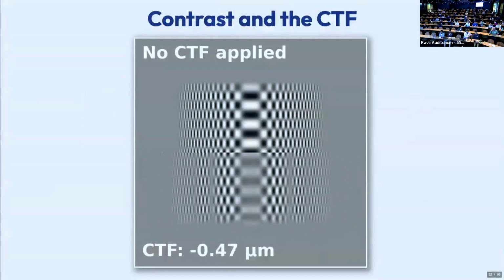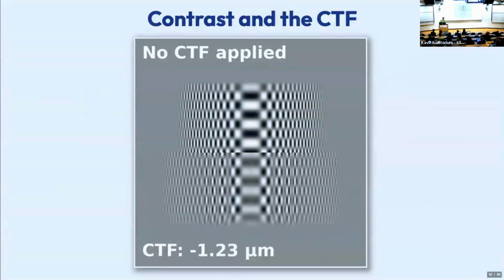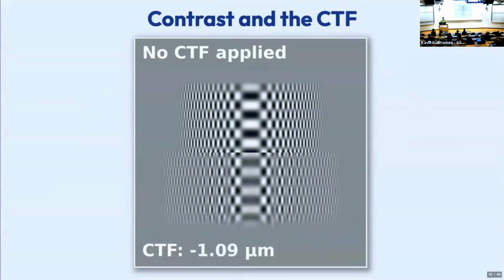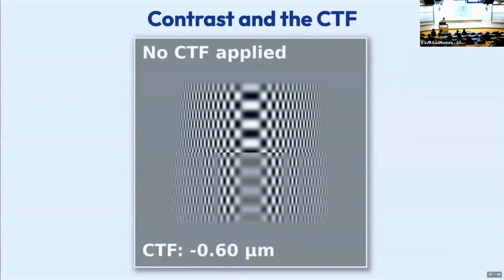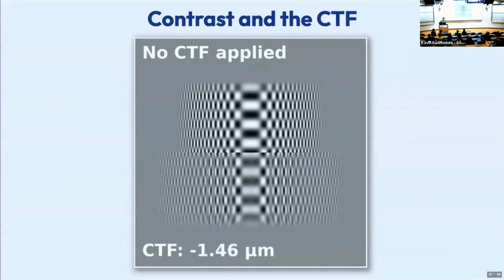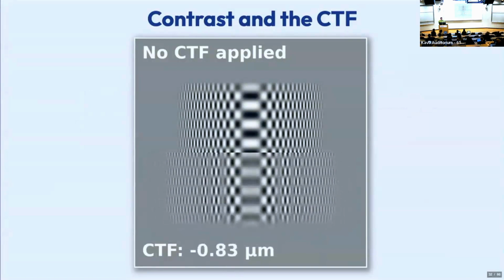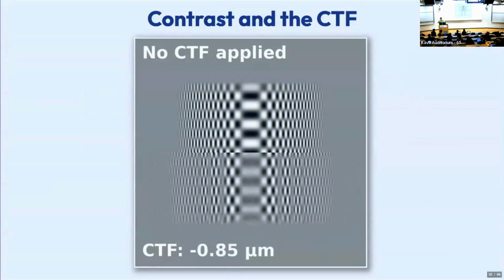Oh, okay. See, this person is trying to get me to spend an hour talking about the CTF. So I'll tackle the first one first. How big does the box have to be? We'll talk a little bit about that in later slides when we're talking about particle extraction. But the general rule of thumb is 1.5 to 2.0 times your largest particle width, like your biggest diameter.